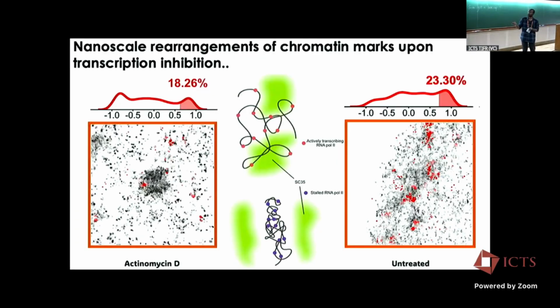So the moment you inhibit transcription, most of the speckles become these round donut shapes. Yeah, I see the difference, but maybe there's some structure in these. We haven't really analyzed the structure because each cell has multiple speckles, each carrying a different shape, so we didn't really see a pattern there.